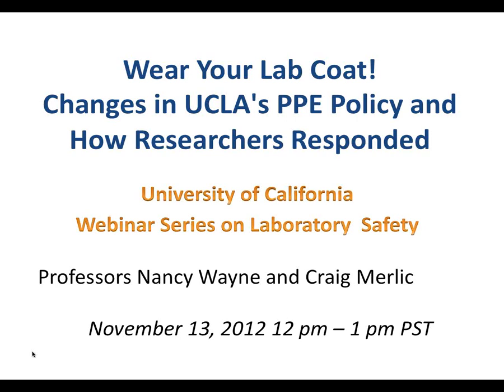What are the impacts to non-chemistry labs, such as electronics labs or field work? Have you had much interaction or feedback from those labs? Yes, I have actually gone out and met at faculty meetings with every single department on campus that works with any type of hazard. With electrical engineering, chemical engineering, they have hazards, and they do get inspected. They have to comply with the regulations that are specific for the types of research that they do.